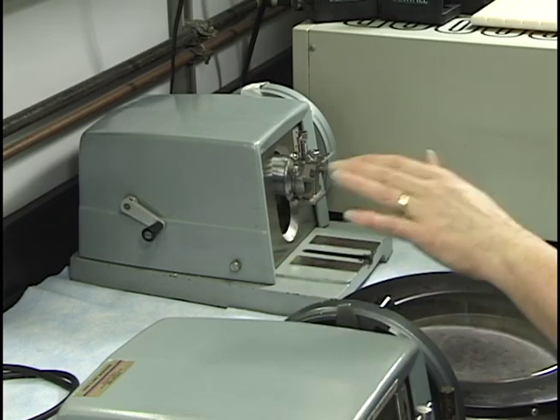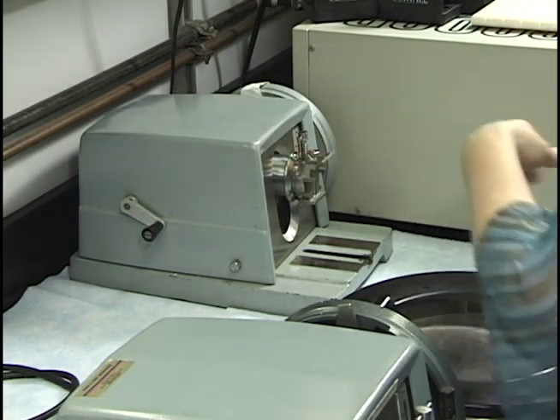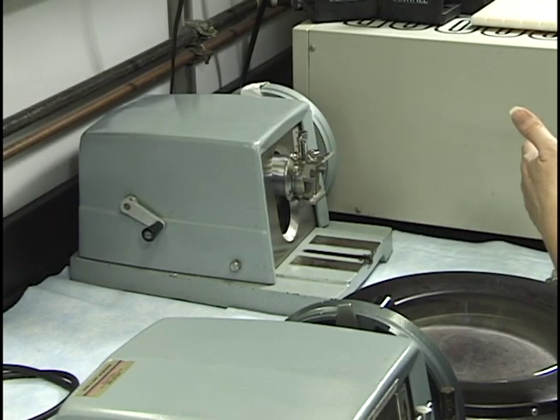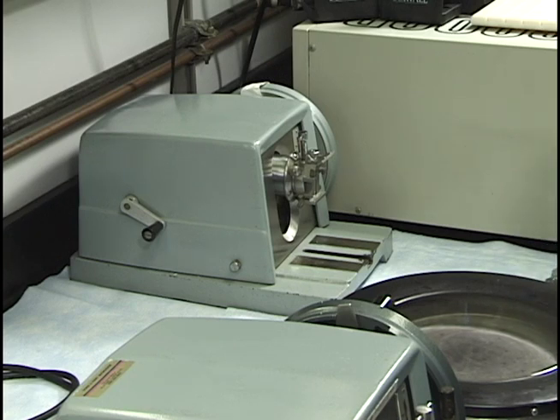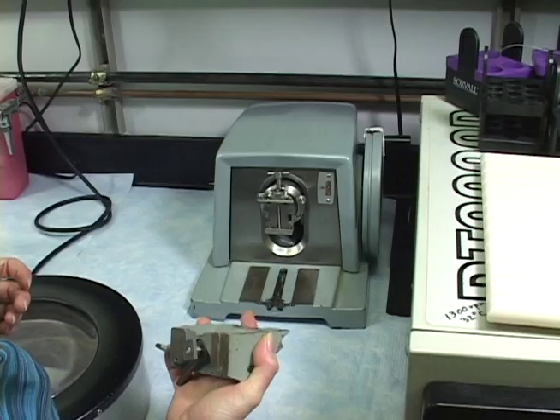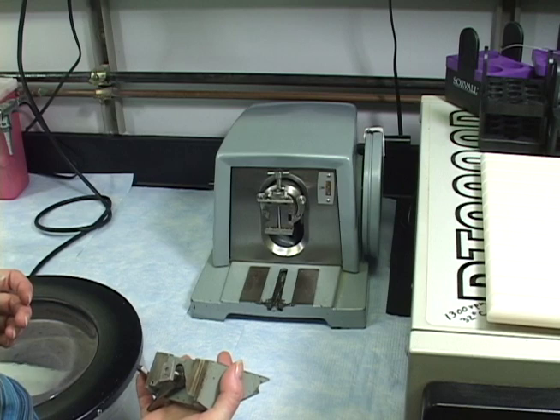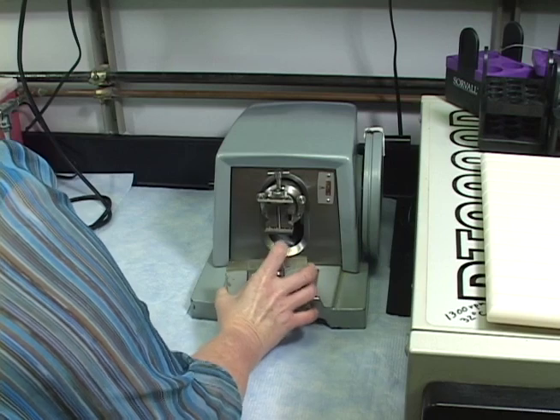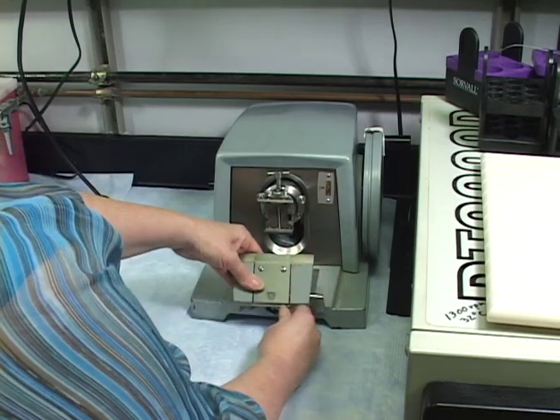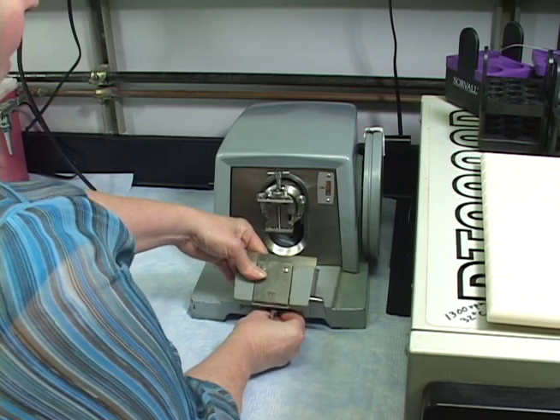If you start tilting it too much and doing too much with the block faces, you get to a point where you're actually affecting the angle at which it's going to cut, and you're really not going to get a very good ribbon. You're going to end up with a block face that's really shaved completely unevenly, and it's really a sign of a microtomist that really does not know what they're doing, and really shouldn't be microtoming if they have a block with one side really shaved and the other side not. So you really want to try to keep the block as evenly all the way around faced as possible.